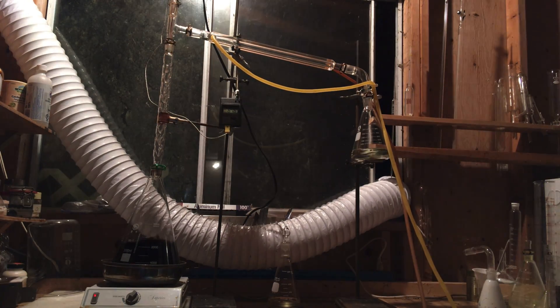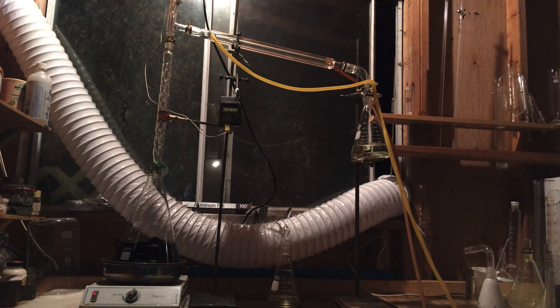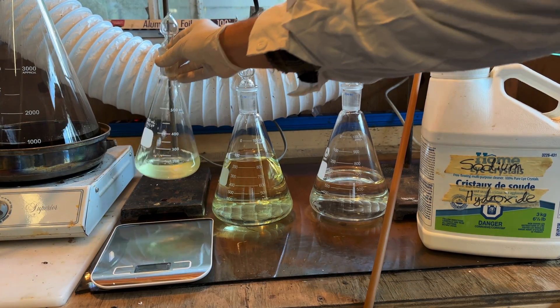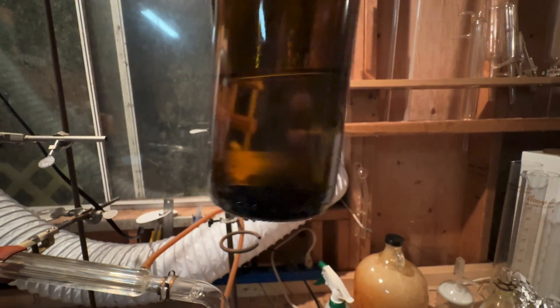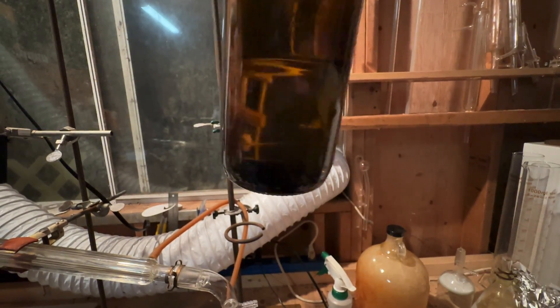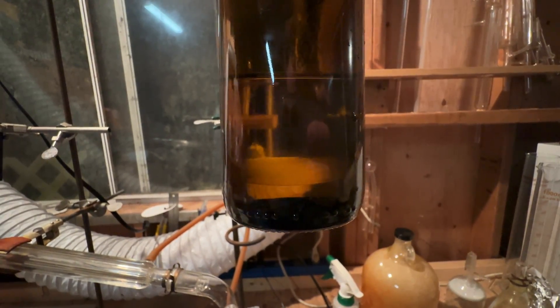As the temperature increased, everything that distilled over below 85 degrees Celsius was collected and set aside. 150 milliliters of low boiling point side products were obtained, and interestingly they formed two immiscible layers. One of the side products is likely acetaldehyde formed from the dehydration of the ethylene glycol, though it was not certain what else would be present with it.